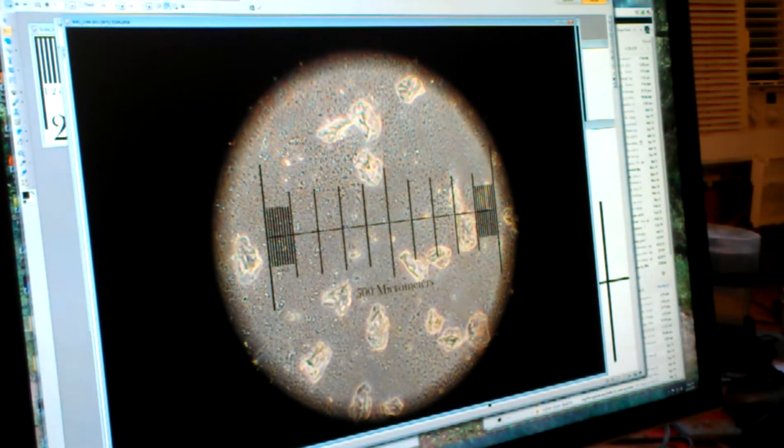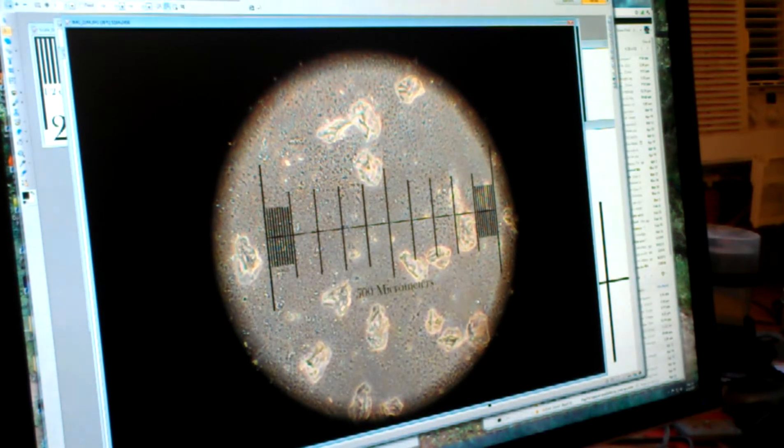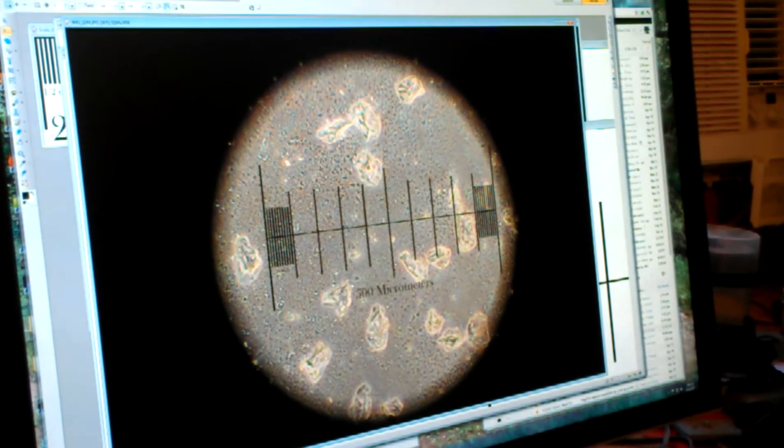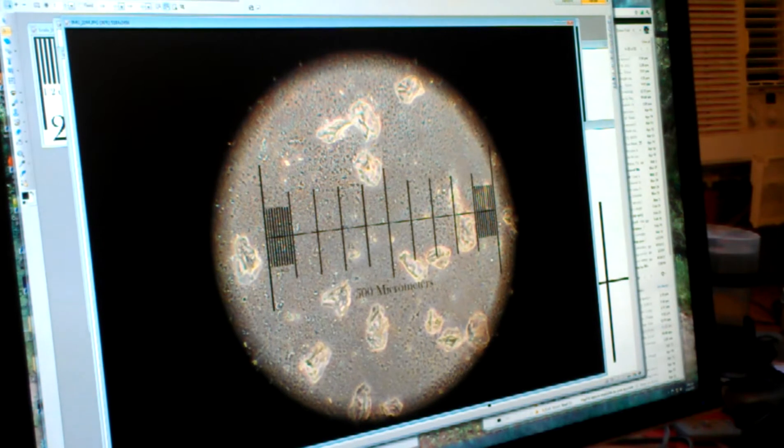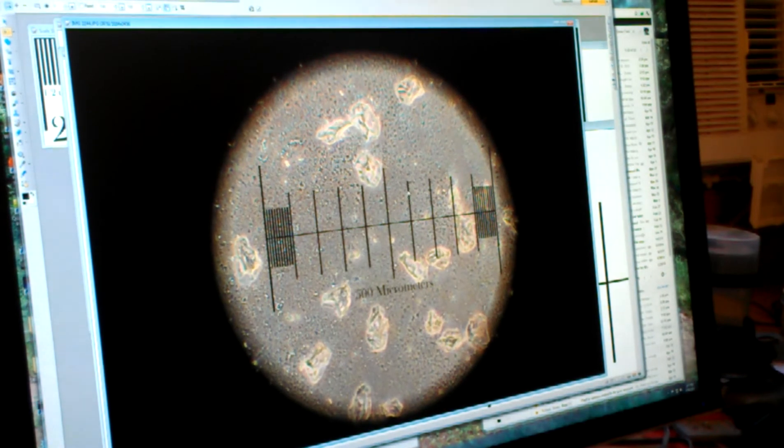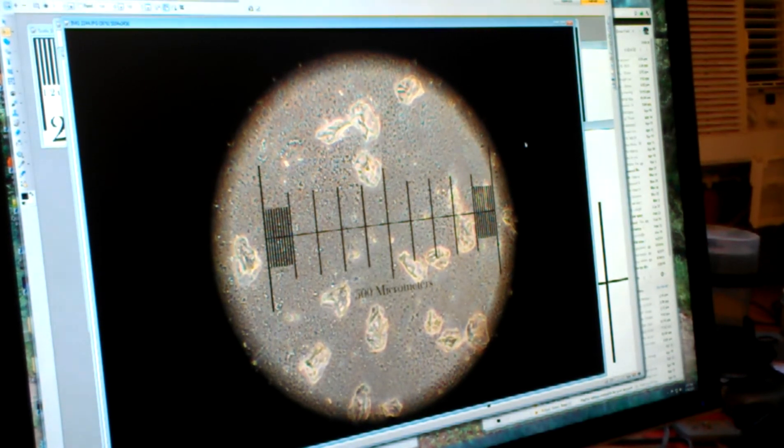They'll be the same as the mounting fluid and we'll only see the cells. So what is from here to here in inches or in a meter, centimeter? Oh, that's half a millimeter. It's 500 micrometers, is half a millimeter. There are 10 millimeters in a centimeter. That's right, so sense of scale for people watching this.